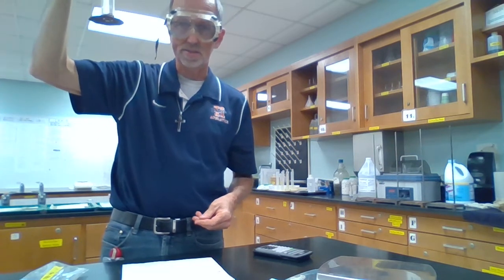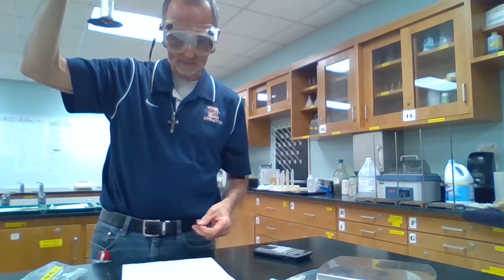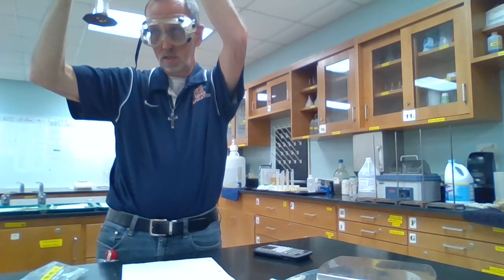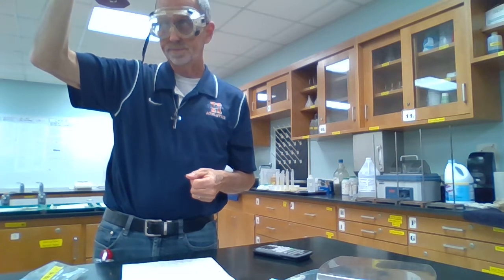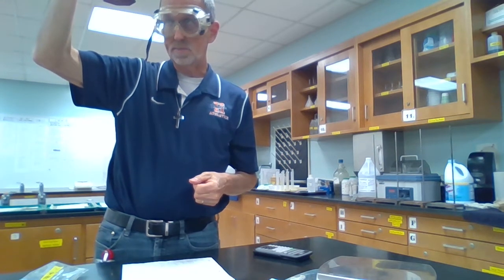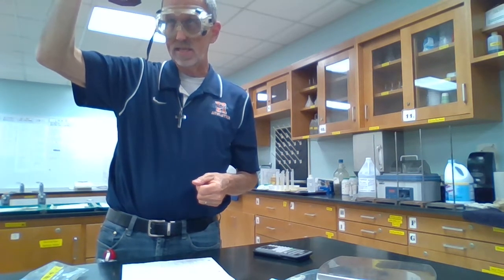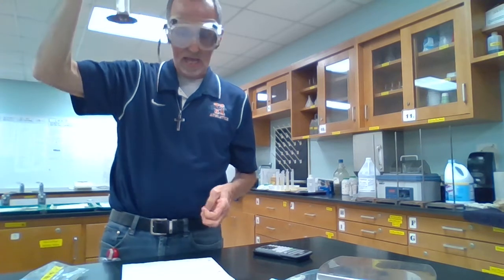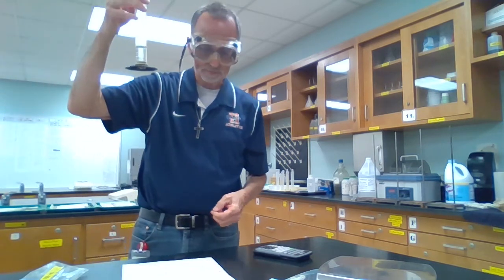Not surprisingly, it went up a full ml, so now we're at 1.0 mLs for 2 pennies. Third penny, well, didn't go up all that much. I'd say that's between 1 and 2, but not really halfway. I'd say 1.2 mLs for 3 pennies.